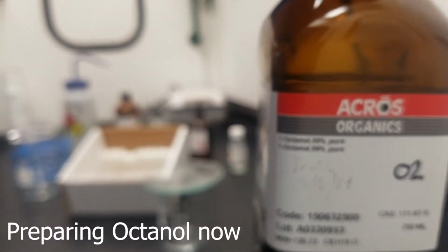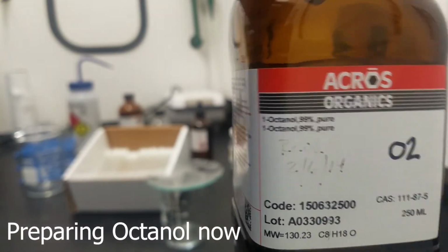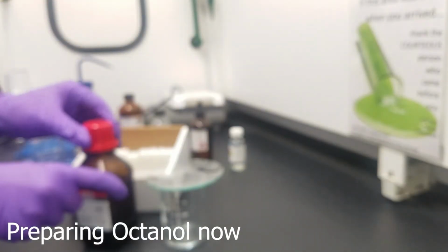It's been a little too quiet for too long, so we'll go ahead and point this out because someone invariably does note. We have the stock bottle here, and what we're about to do is dip directly out of the stock bottle. This is not a good proper protocol. We should be pouring it into a secondary container and then dispense. Why are we doing it this way? That would be a good question.